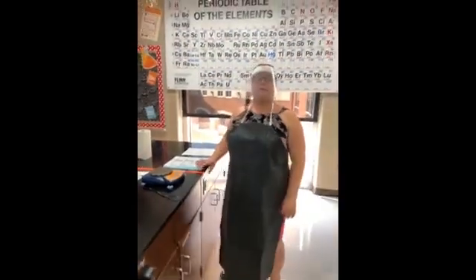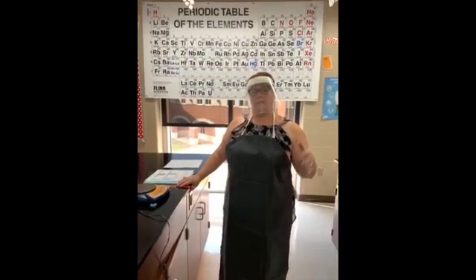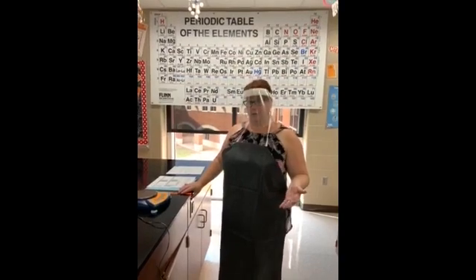All right, hello everybody. We are now going to be doing the penny density lab. So you should have the assignment pulled up and you should be looking at the penny density lab handout.